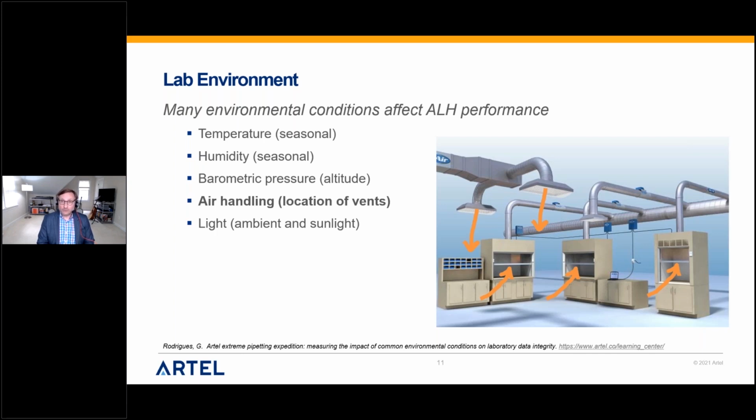There could be cooling or heating unbeknownst to you, or if you've got airflow, you can actually cause evaporation of your reagents and biologicals and whatever you're working with. So it's definitely a big thing to consider.